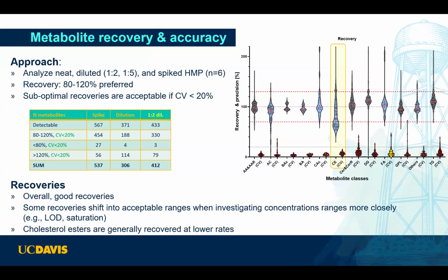And then you could have a metabolite that is not really present in the milk, but present in the plasma, which is actually nice because then you get kind of an idea how that metabolite is recovered overall, given that we used one human milk pool. But as Terry already mentioned, there are many different influences that could change your metabolite profile in the milk. So you might have these metabolites present in a different milk. So it's nice to see that we could get some recovery ideas about that too.